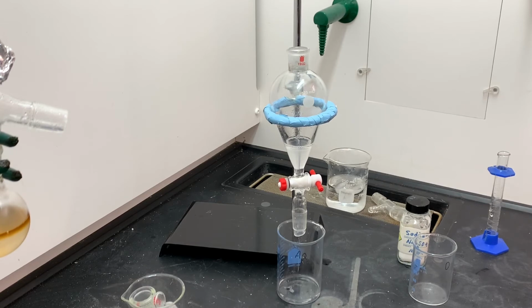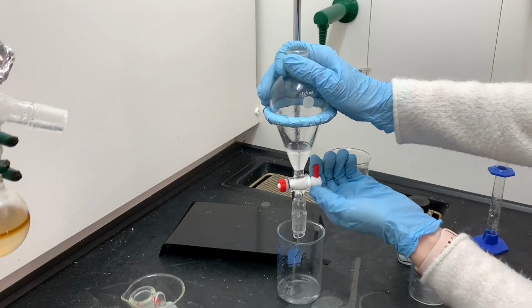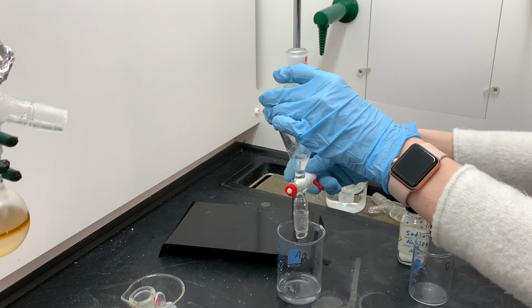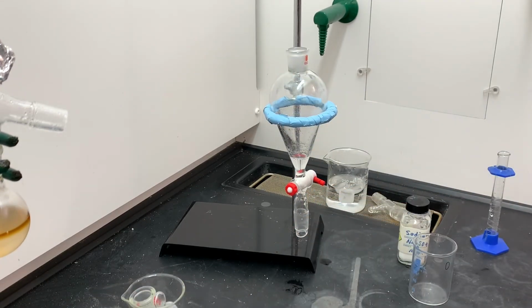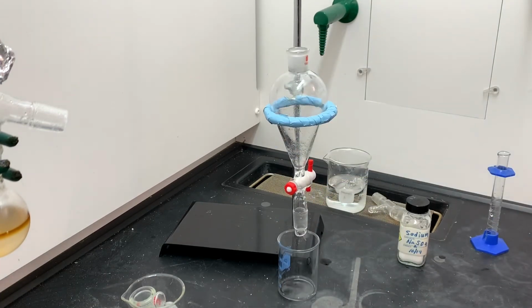All of these bottom layers I'm just draining into the same beaker because they are all just waste. And this time I want to make sure that all of the water, saturated sodium chloride, has been removed. It all needs to be gone. Now there's our clean and pure product inside that separatory funnel. I'm going to put that into a new beaker.